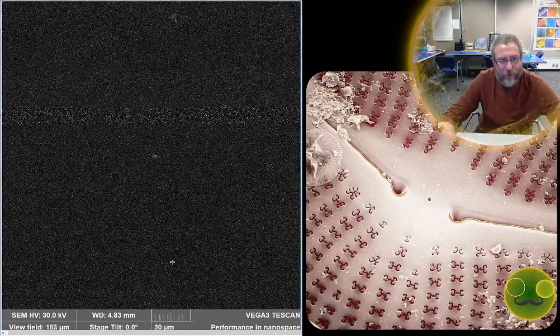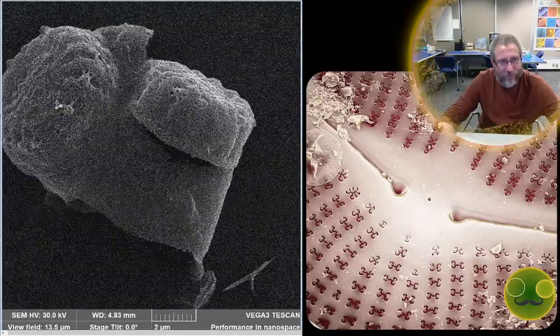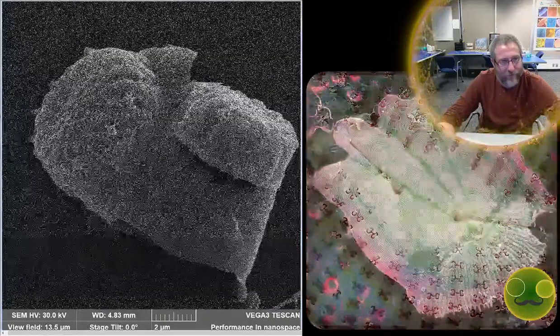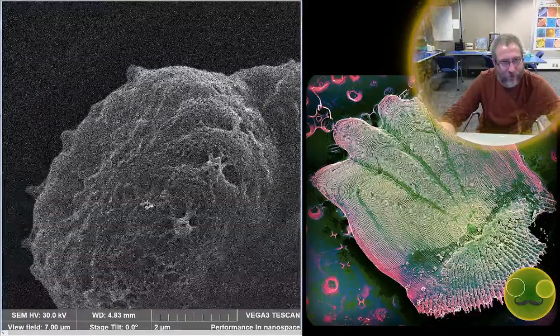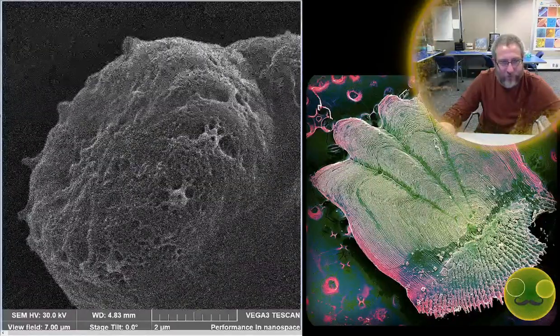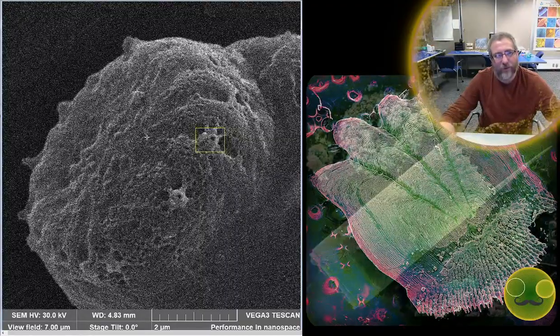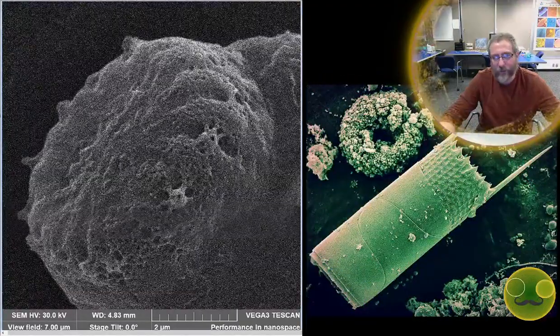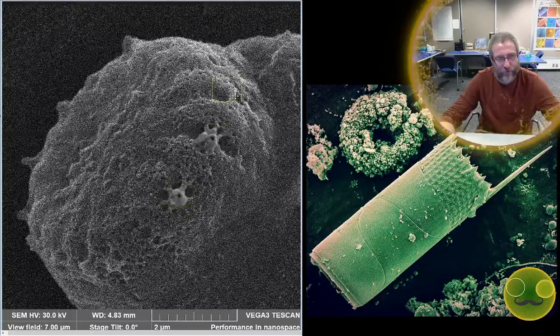So they're making these very long cells that are... Oh, that one you can see the valve face on a little bit. That's what I want, is the valve face. That's like a quarter turn shot again. And you can see a little bit of the topography of it, so that's nice. And we can also get a nice close-up of these crazy spine structures. Very cool. All right, we're gonna slow that down. And I just wanna make sure that these are gonna turn out okay focus-wise.